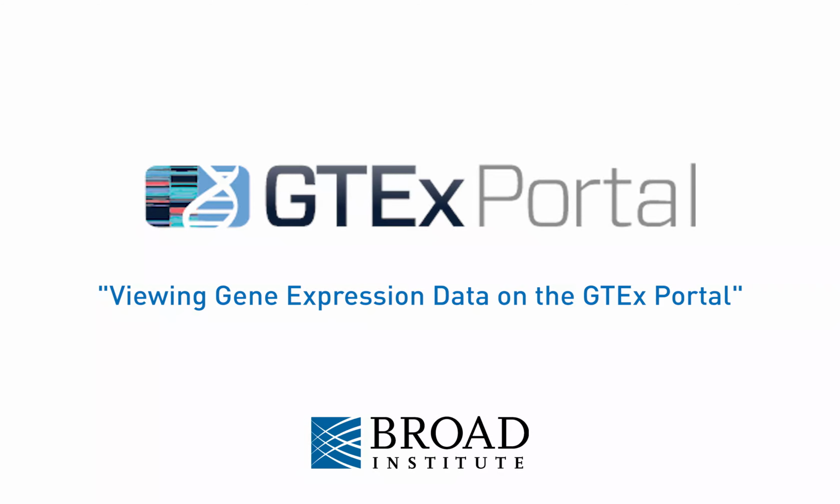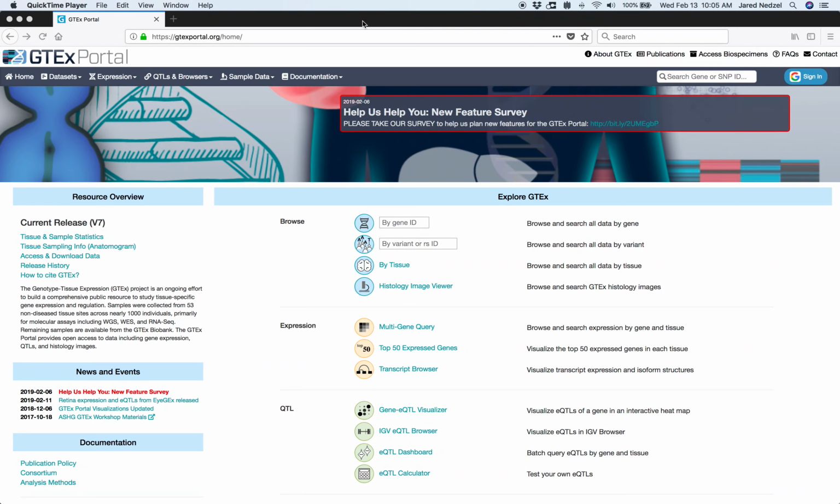In this video, we will demonstrate different ways you can view gene expression data on the GTEx portal, whether you have a single gene of interest, multiple genes of interest, or a tissue of interest.